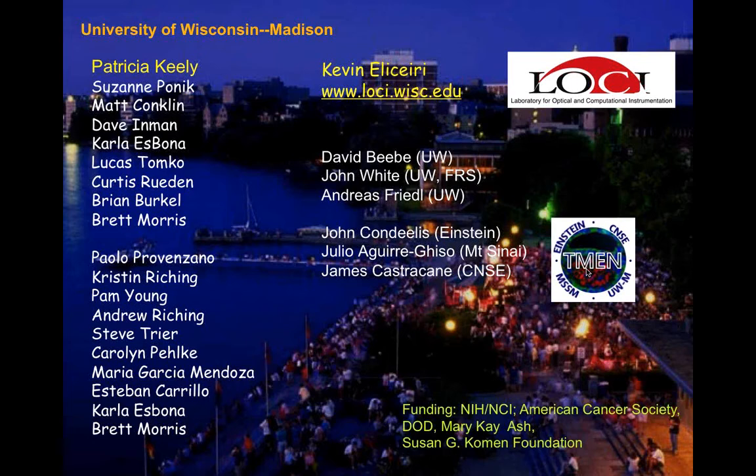And so yeah, we absolutely see, all of our research that I presented first was actually all done by removing the tumor and slicing it and looking at their second harmonic generation. But if you're asking, did I do these control experiments looking at the endogenous fluorescence that I was describing with NADH and FAD and their lifetimes? It's interesting.